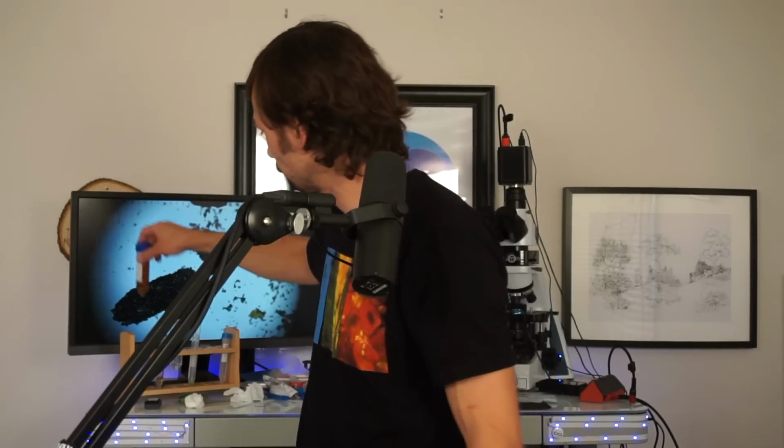Right. And so there's so little waste. It can be absorbed by the biology right there and then, and you might have to add more drops to get it to sustain, for you to take your pictures and do your evaluation. And so, yeah, it's an incredible dye. I saw all these people with microscopes that were like 3 times as much money as mine using it, and I was like, I have to figure this out. Your images are too good. And so that's what I did, and it's a total game changer.